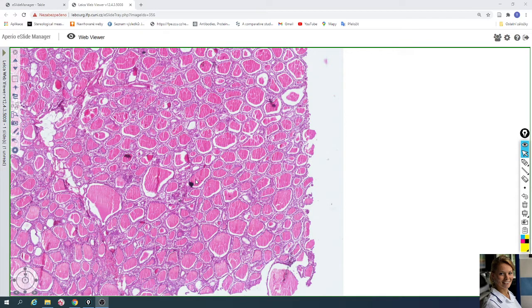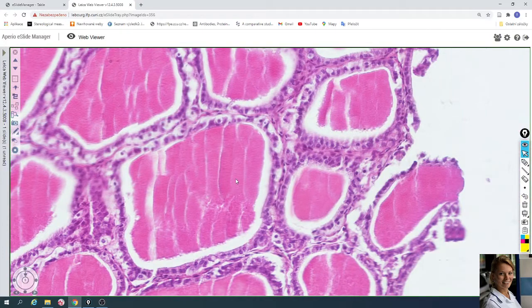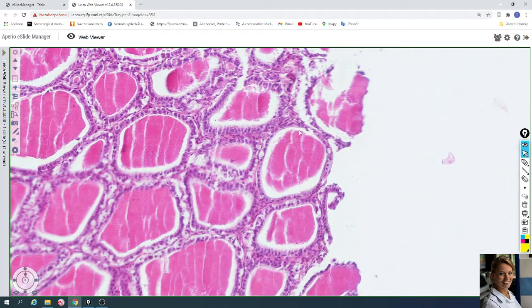The thyroid gland is characterized by spherical structures called follicles. For example, here you can see a spherical structure — this is a follicle. The follicles are filled with an acidophilic colloid which contains thyroid hormones. This is the follicle filled with colloid containing thyroid hormones.